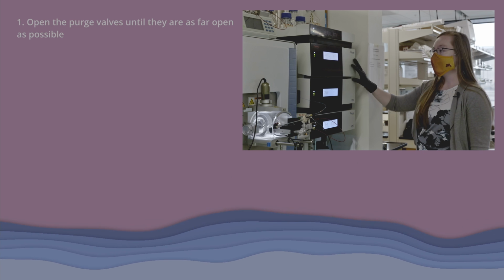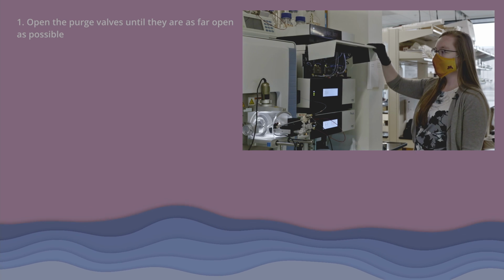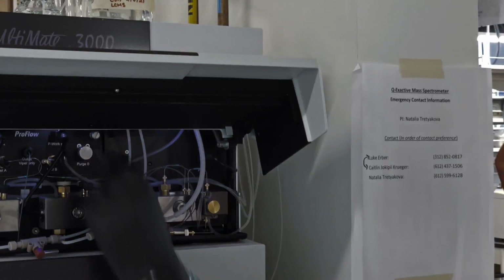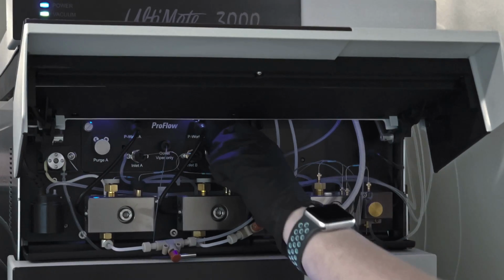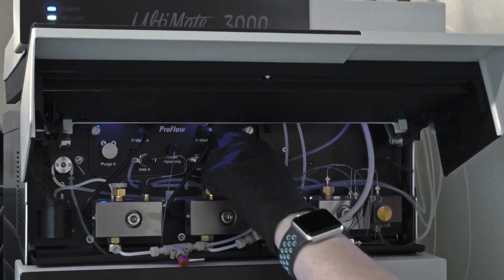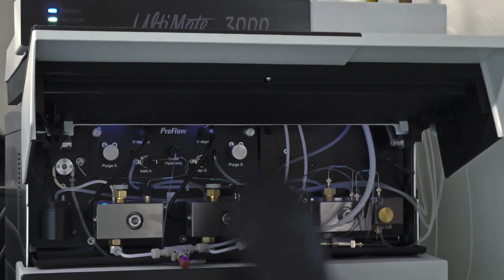Once you have your solvent bottles in place, you'll open up the door to the pump and you'll open both purge valves. You have to turn these until they're all the way open, and you'll feel when they hit a stop point.